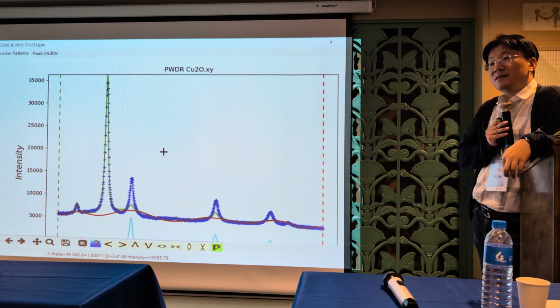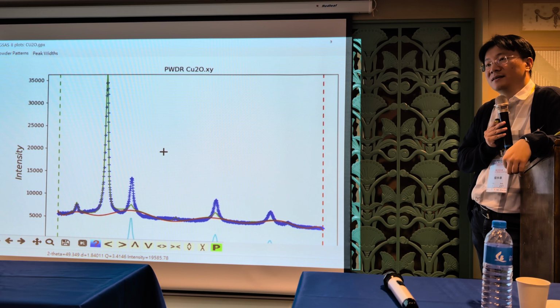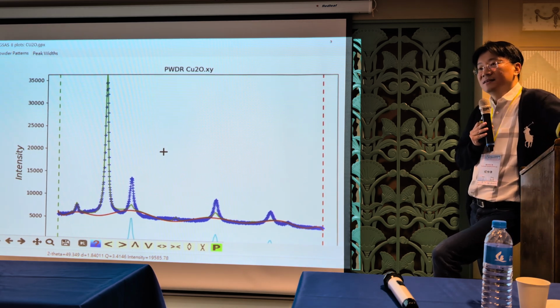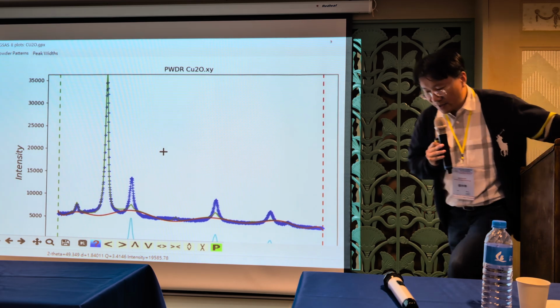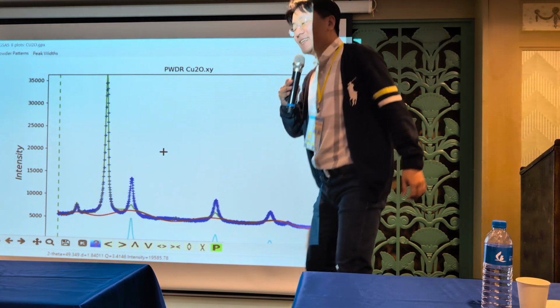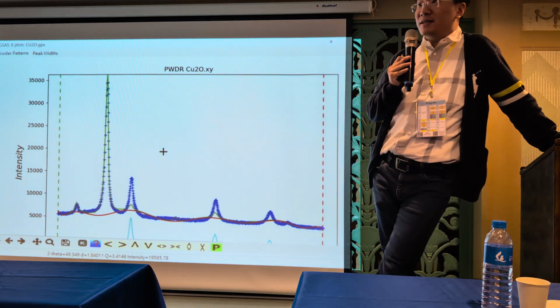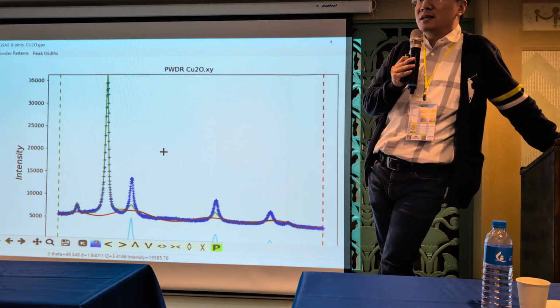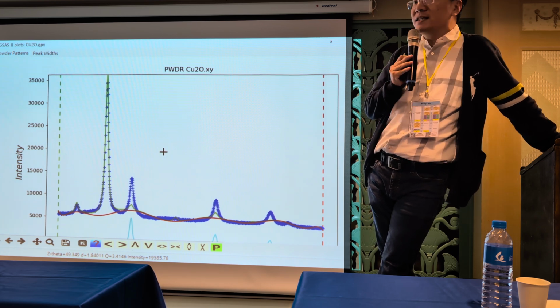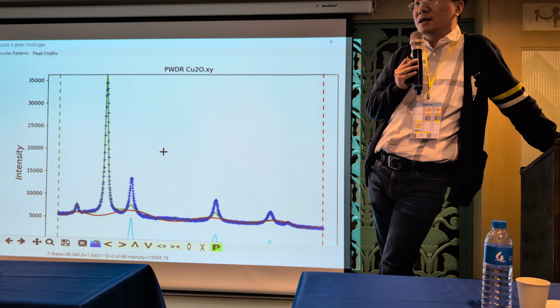Yeah, so if I have a sample that shows the charge density wave phase, and I want to find the modulated electrons, if I want to locate those electrons in real space, can I use the delta F Fourier map to do that? In principle, you can do that. Try this one. Yes, because we will see some missing diffraction intensity. So if you use the Fourier density map, perhaps you will see such a thing.